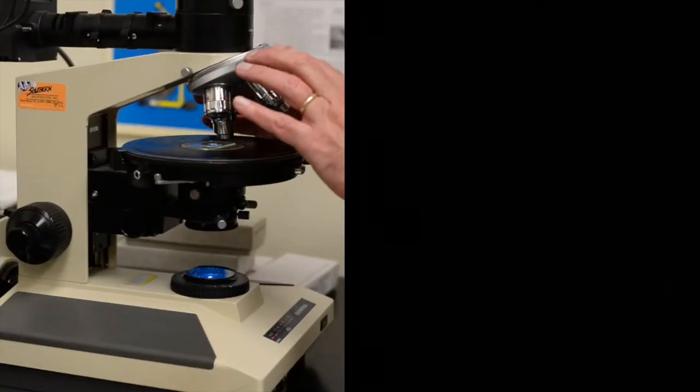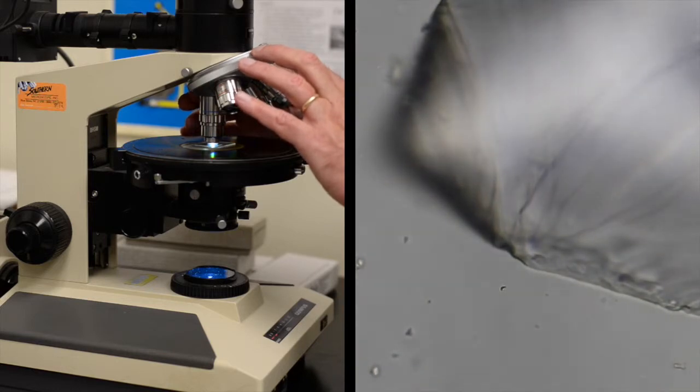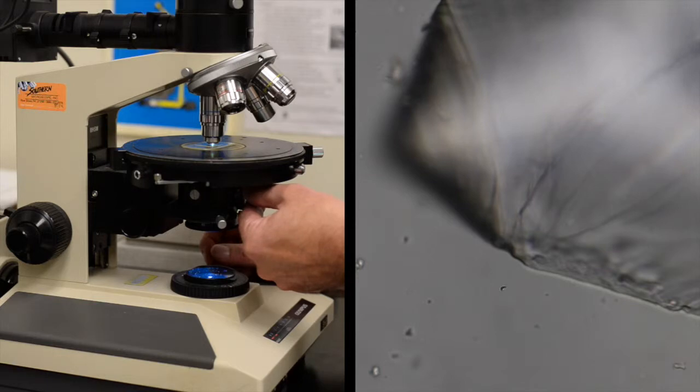The highest power objective, which on this microscope is a 50x objective, so I'm going to swing that into the path of light. And this is an edge phenomenon, so we're going to cut down on the light a little bit using a diaphragm under the stage, which enhances edge effects.